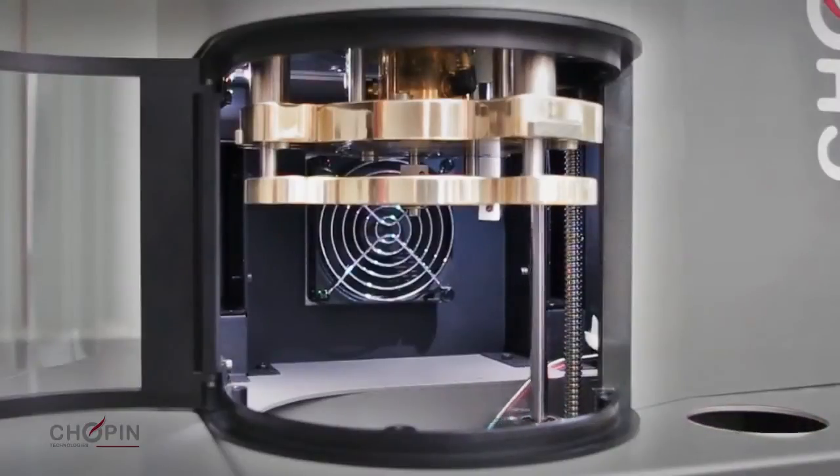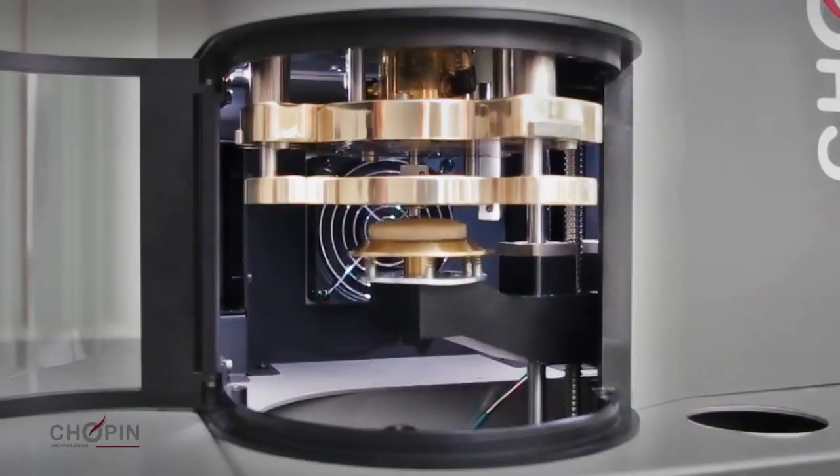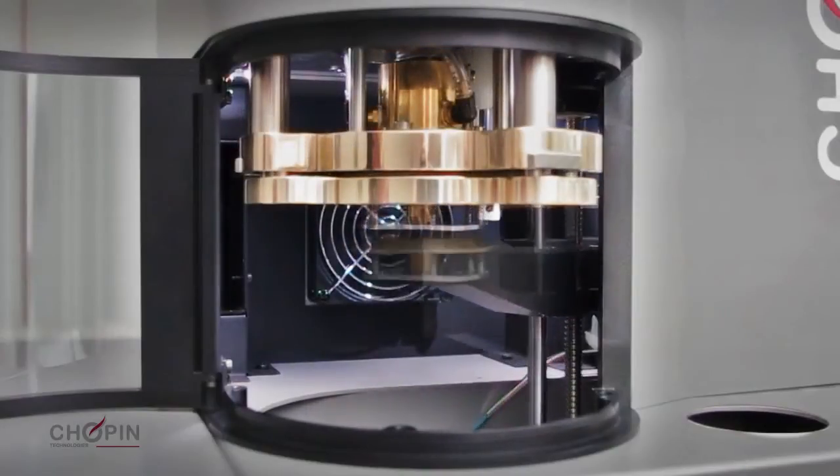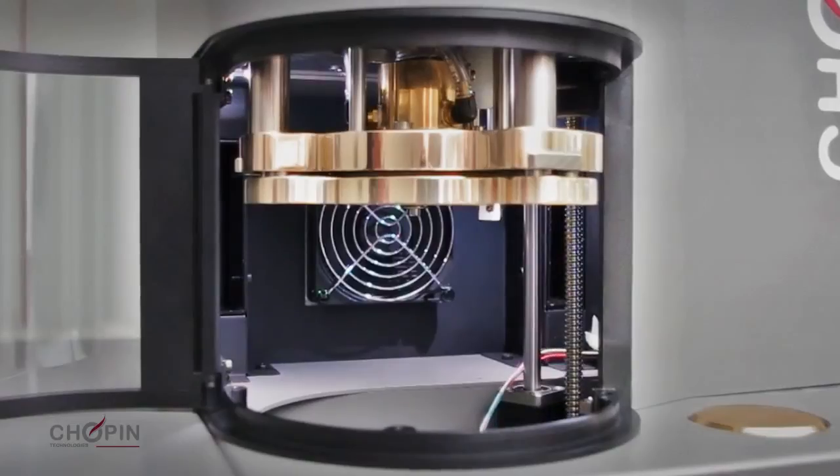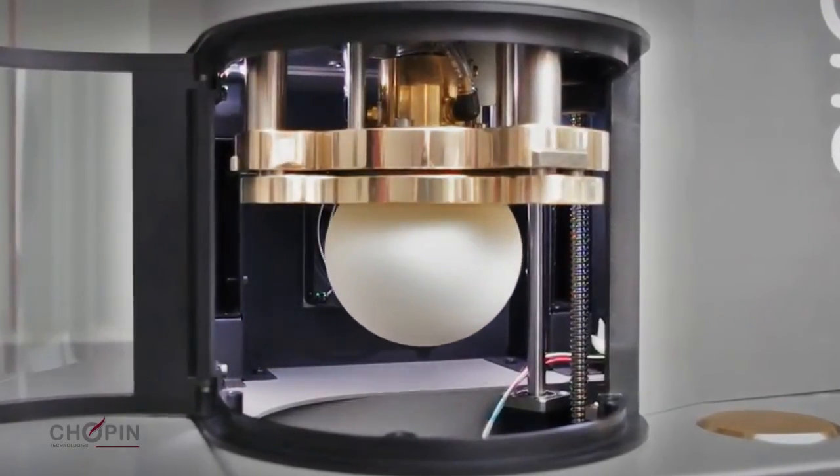Other innovations include automatic positioning and swelling of dough pieces in a humidity and temperature controlled compartment, and the inverted bubble, which is more spherical and closer to the ideal test conditions.